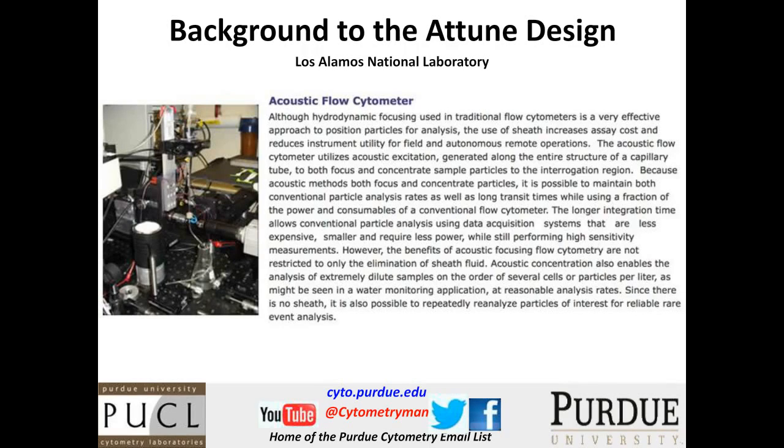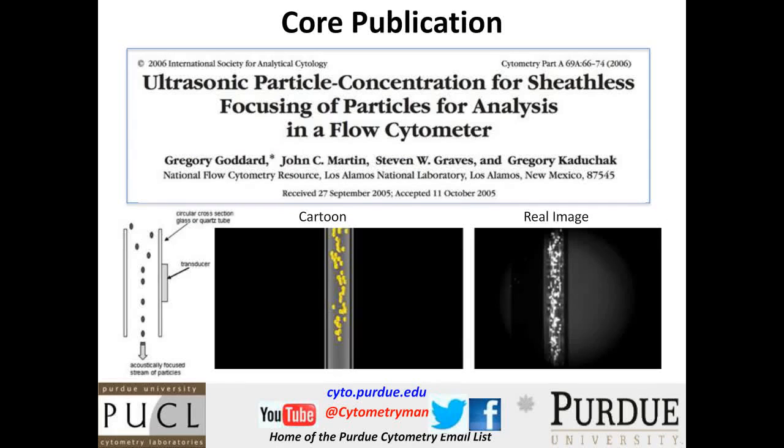Now, if you go back a few years when he built this first prototype of the acoustic system, you'll see here it looks, well, pretty much like a prototype, something that would probably end up things that I build in my lab. Interestingly, his first thoughts on this, he brought to people at Los Alamos, and he showed them this idea, and some of the people at Los Alamos said, you know, you could build a flow cytometer with this. And the original idea was maybe you could do this without having sheath fluid. And that was the original concept of building a sheathless flow cytometer.